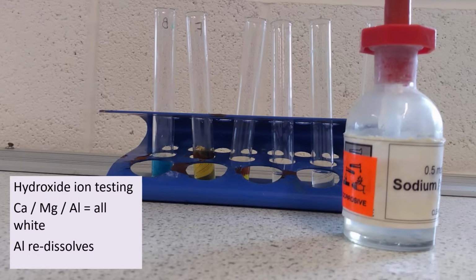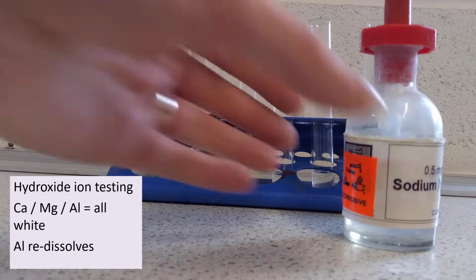Now, my last 3 are a little bit harder to tell the difference between because they all form white precipitates.